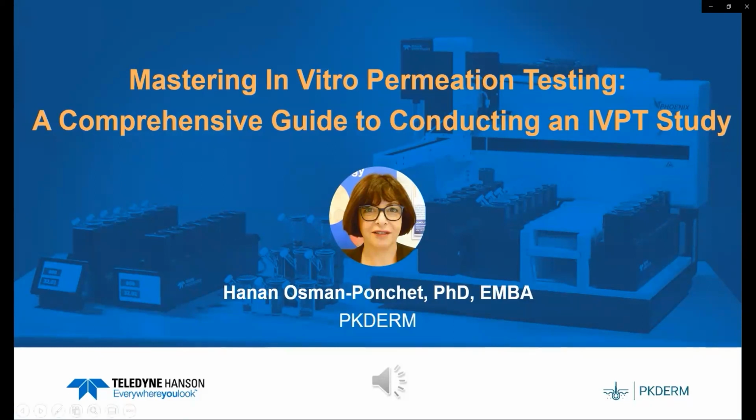Hello, everyone. I am very happy to present the webinar on how to perform IVPT. I hope this webinar will be useful for the audience. My name is Hanan Osman-Ponchet, and today I will show you the different steps of conducting IVPT using excised human skin.